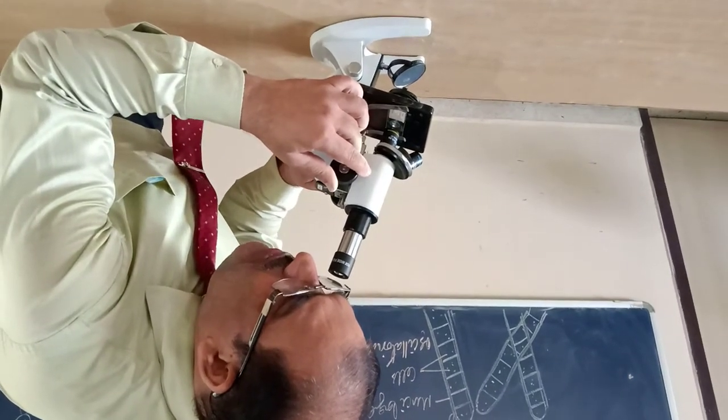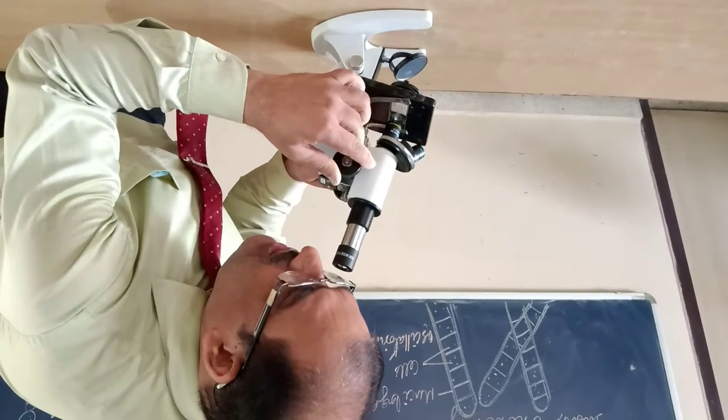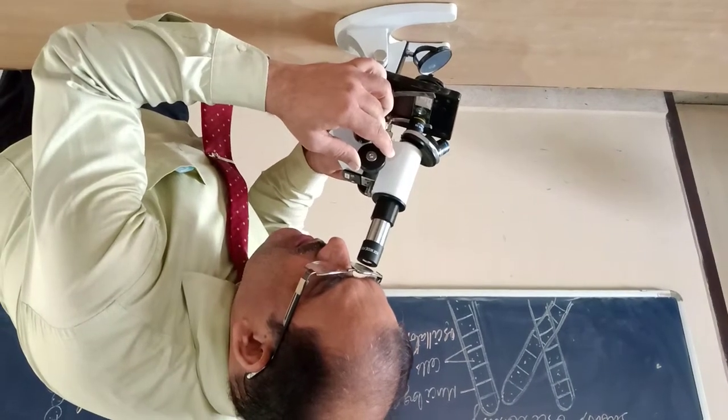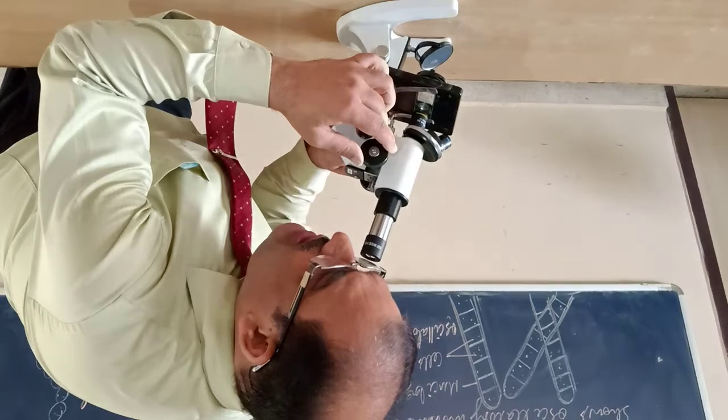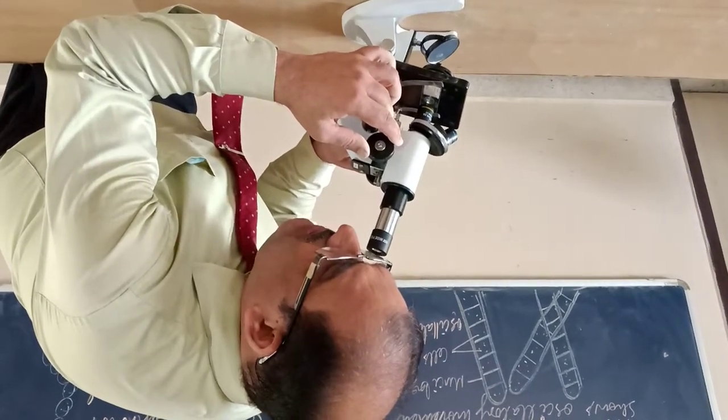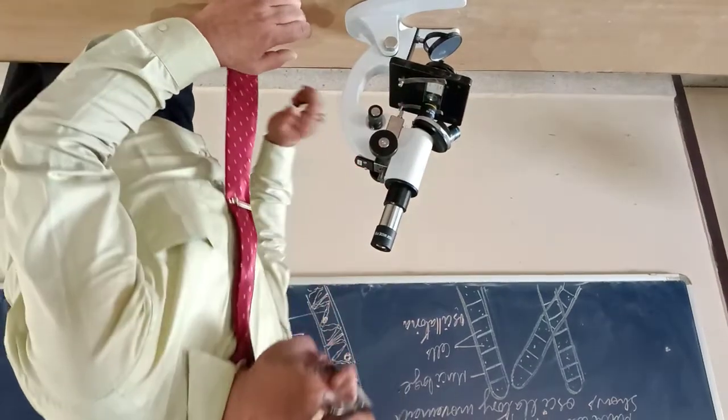Now we can see each cell. We can see the oval cells, each a unicellular yeast, and a few cells are multiplying, arranged in chains, forming the bud, showing the budding. So this is the way we have to see the slides.